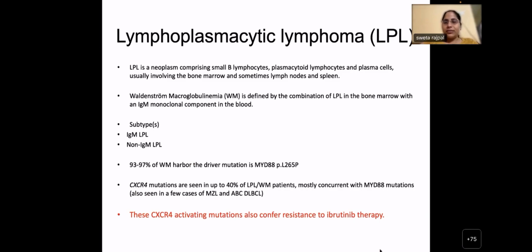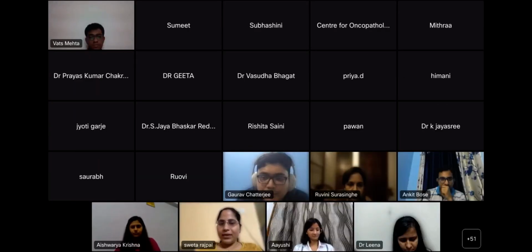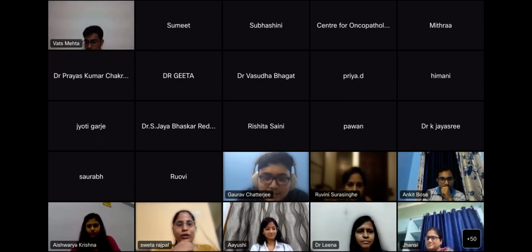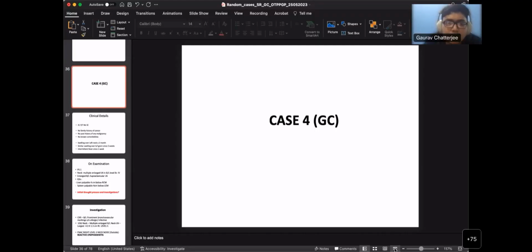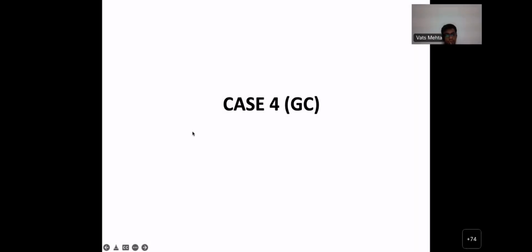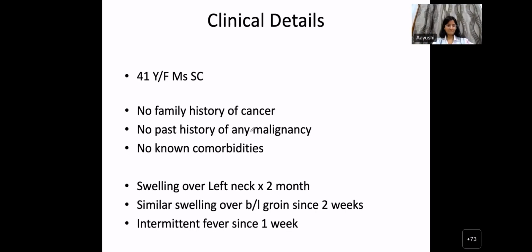Any questions? No, I think people have mentioned the markers of plasma cell, but I can't see any question yet. Right. Okay. So, Gaurav, you can go ahead with the fourth case study. Yes. Okay, just give me 1 minute. Right. So now, whom do we go to? Maybe Lina, can you take this?